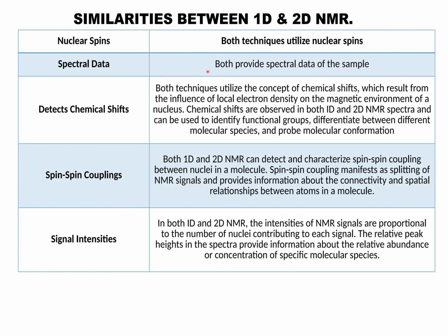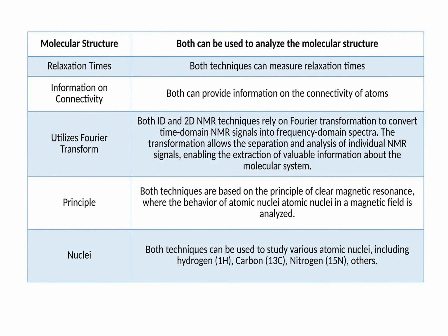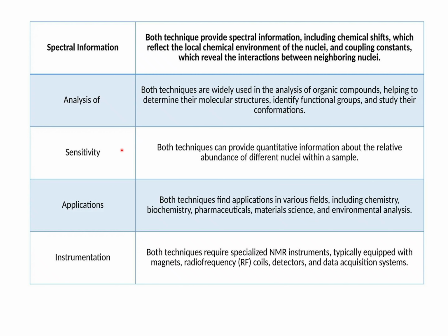However, there are some similarities. Just go through the similarities. Actually, both function with a similar mechanism, and the main difference is the additional peak that appears in the 2D. There are more similarities between them. Here are also some similarities. Just go through them.